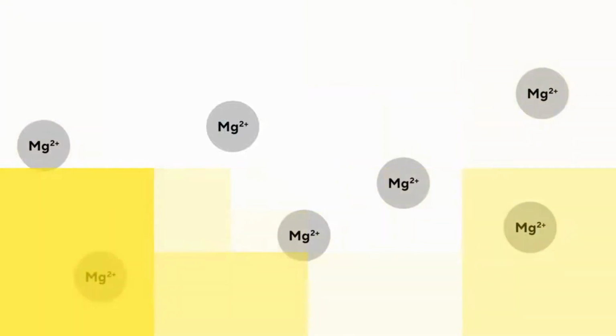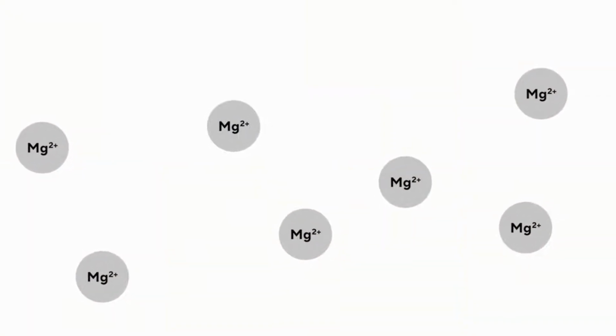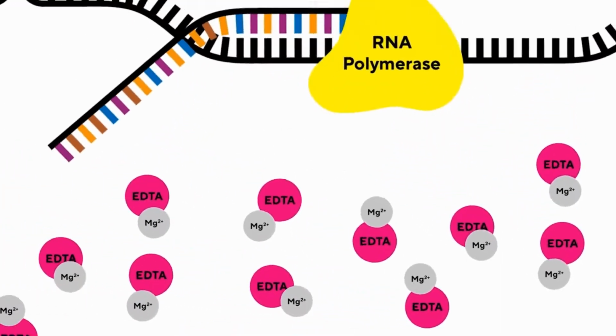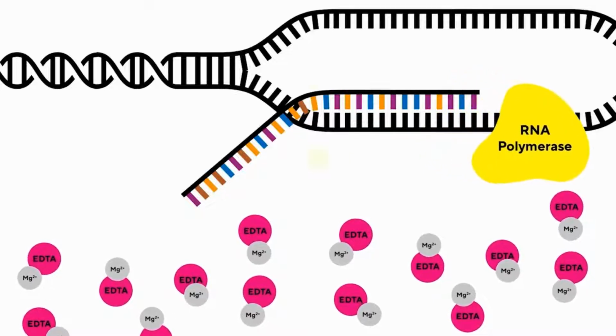We take 2 microliters of the IVT reaction and inactivate it with 2 microliters of EDTA. This binds the magnesium ions, making them unavailable to the RNA polymerase and effectively stopping the reaction. Before PATfix analysis, the sample must be additionally diluted 100 to 400 times with mobile phase A. The dilution is determined based on the predicted end mRNA concentration in the IVT reaction.